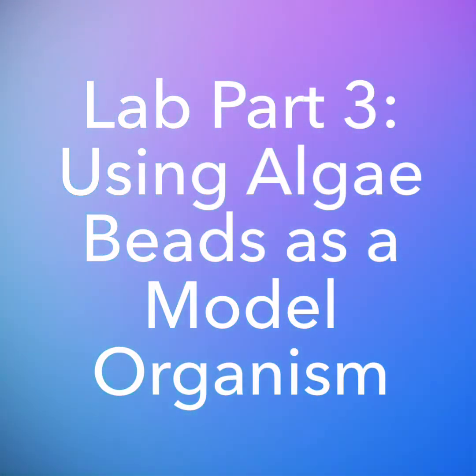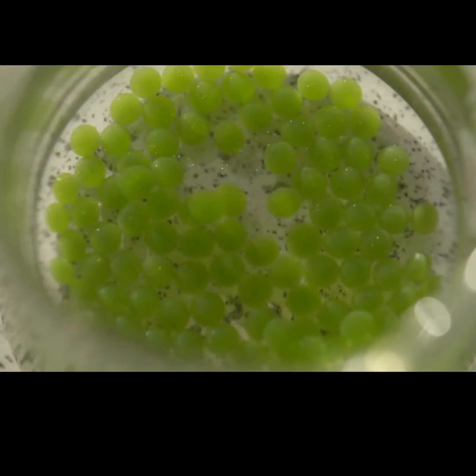organism. For this experiment, we'll be using algae beads to test for the processes of photosynthesis and cellular respiration. As you can see, algae beads are small green spheres. Each sphere is filled with thousands of algae cells.